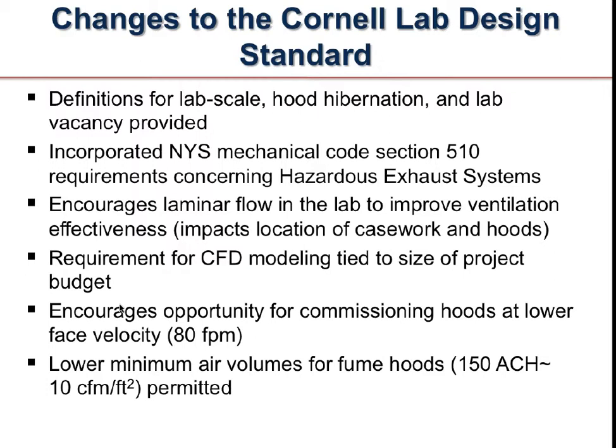They're not all created equal, so we wanted someplace in writing to encourage that we get fume hoods that will meet those requirements, so that when we commission, we can do so at 80 feet per minute. And then we put in terminology for the lower minimum air volumes for the fume hoods.